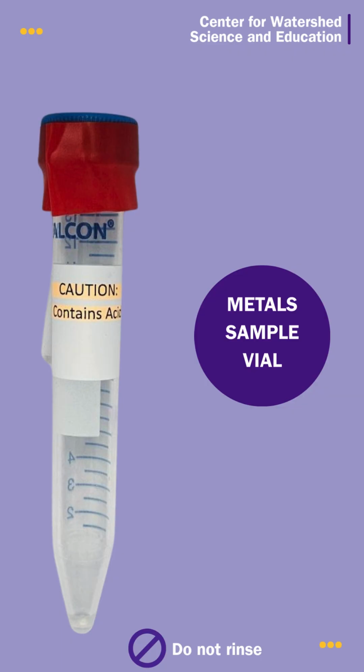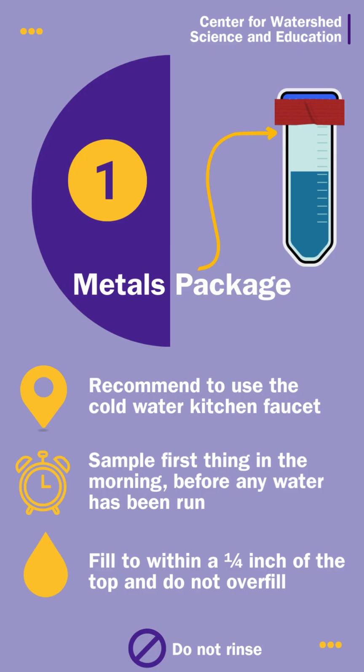The metal sample should be taken using the small vial that has a blue cap with a red tape around it. It is important to note that there is a small amount of acid preservative in this vial. Because of this, do not rinse or overfill the vial. If you do happen to get any of the preservative on your skin, rinse the affected area underwater for about 5 minutes.